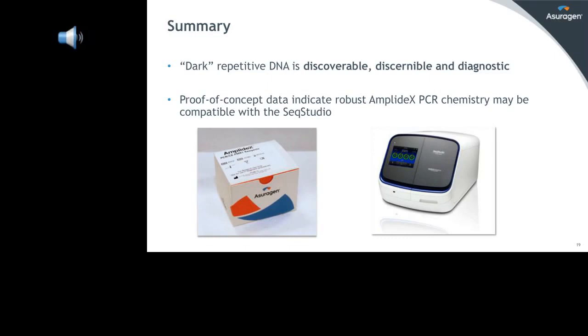And in terms of workflow, most of these assays take less than about an hour of hands-on time to run through entirely, because you do your PCR, you generate your products, depending on the target. And some of these highly repetitive assays have relatively short targets. They might be, again, as I mentioned, only 100 or a little bit more in terms of base pairs, in which case you can do relatively short run times to be able to resolve them. And you would need anywhere from 1 to a few hours for the PCR, depending on the target. So you could run through that entire workflow within the scope of a single afternoon.